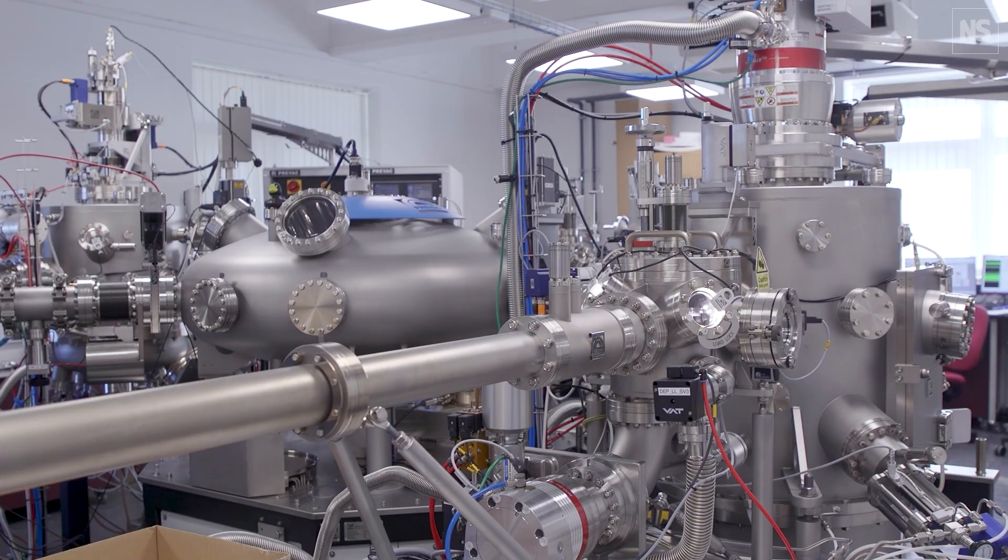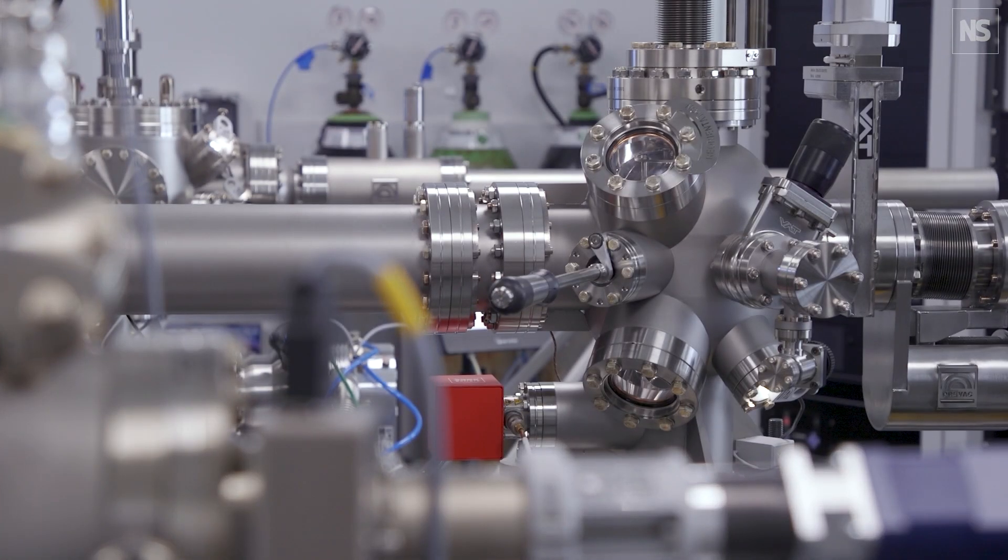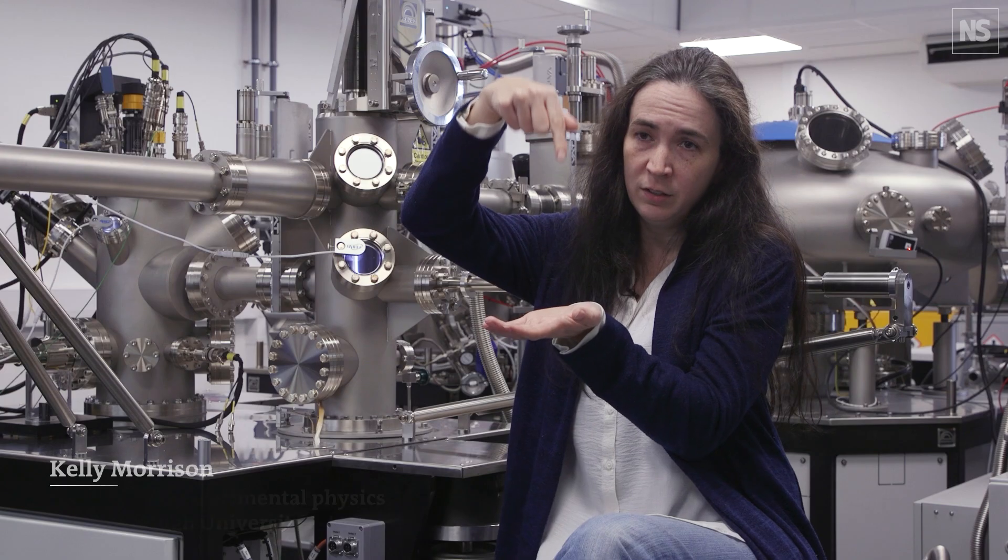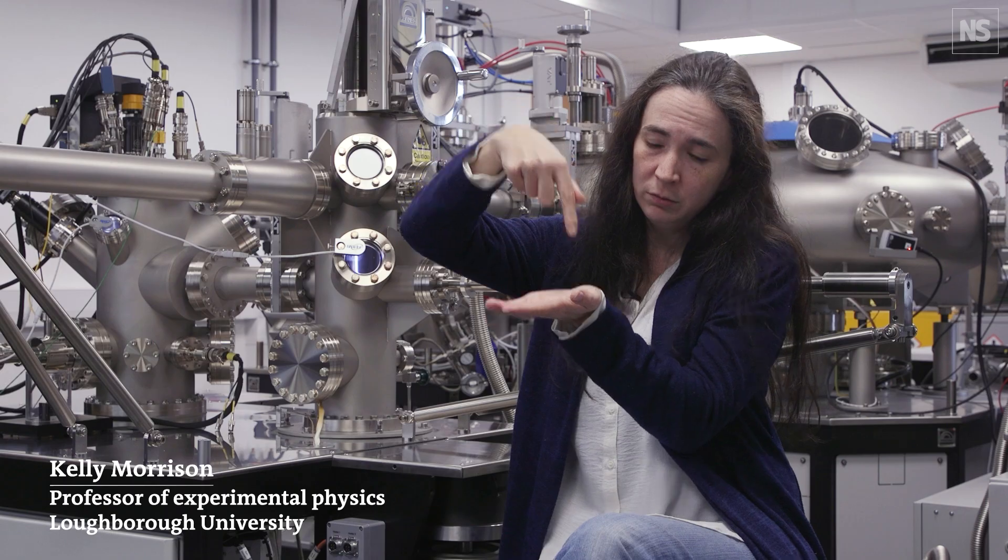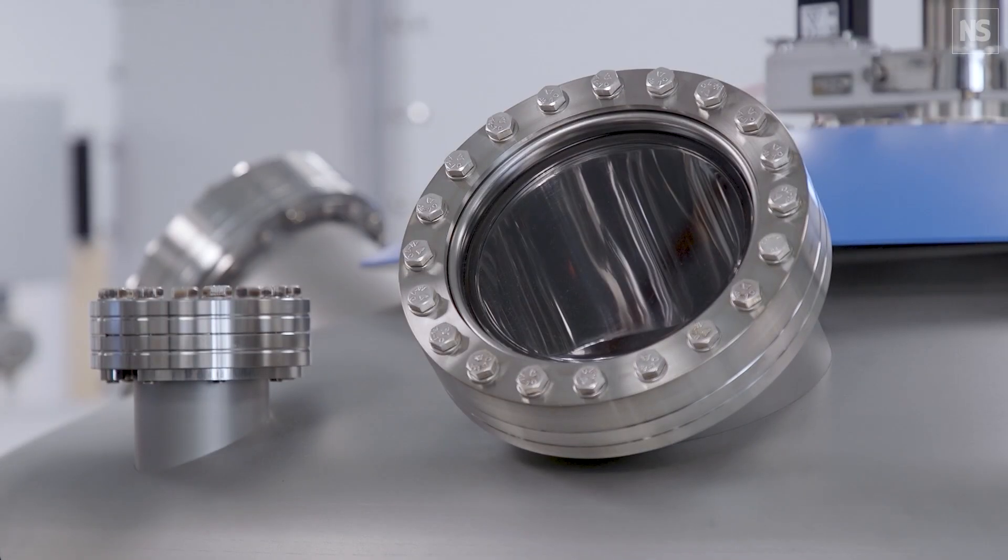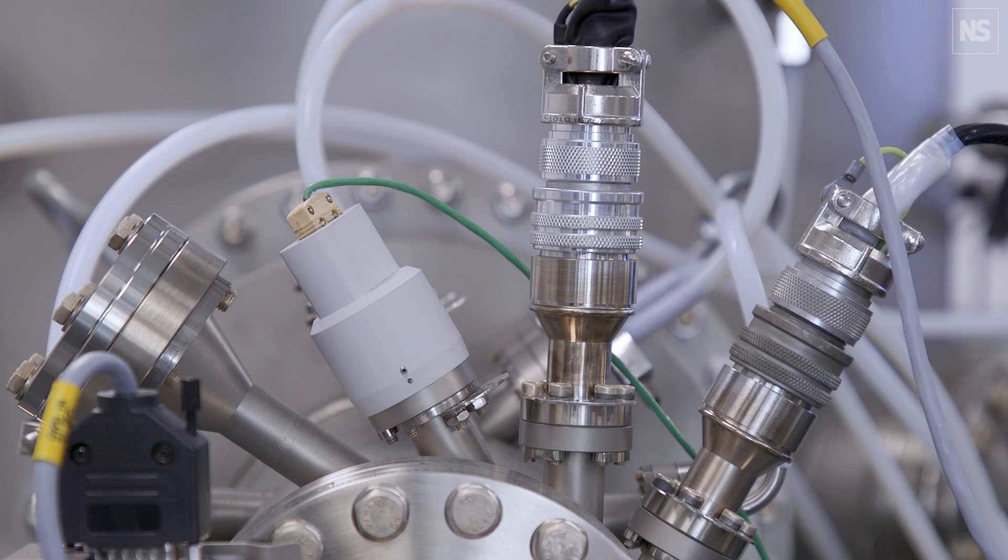The nanofraser is what we call a thermal scanning probe microscope. It's like a very small needle that can see atomic interactions. We take that needle and we heat it up. It can burn away material.